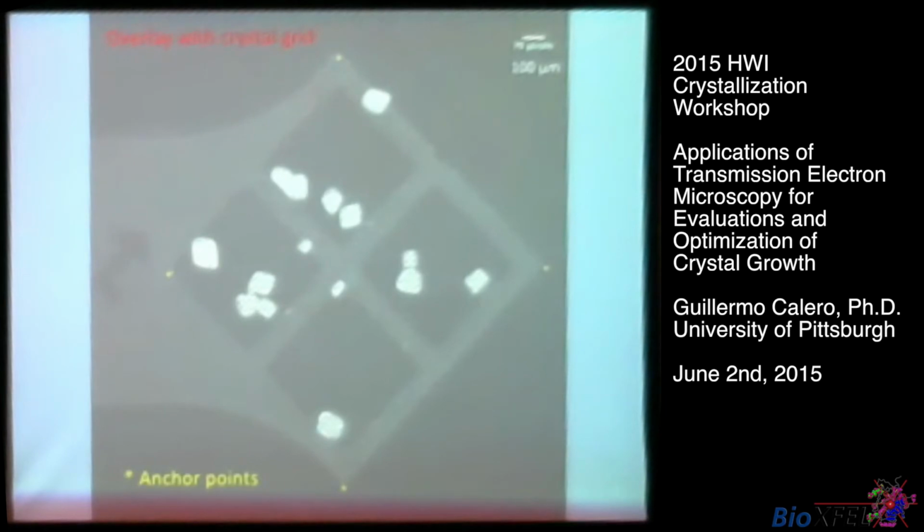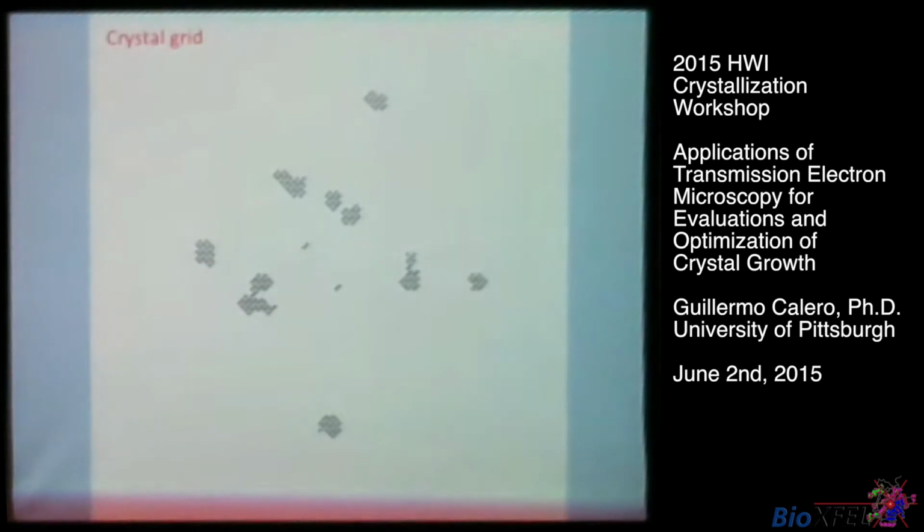And then what we did is, okay, if we have a 200 micron or 250 micron crystal, why waste it with one single shot? So we generated masks, and we're now able to generate this list of points, which are separated by 30 microns.